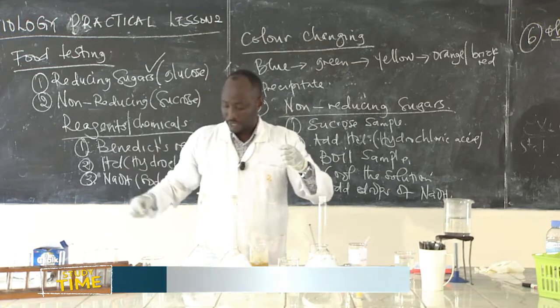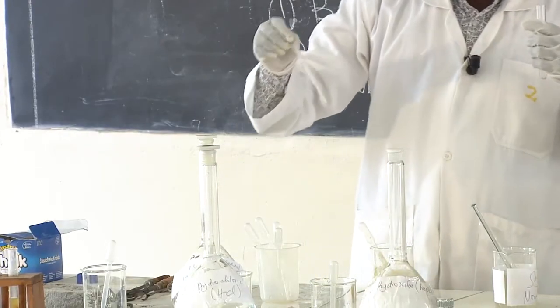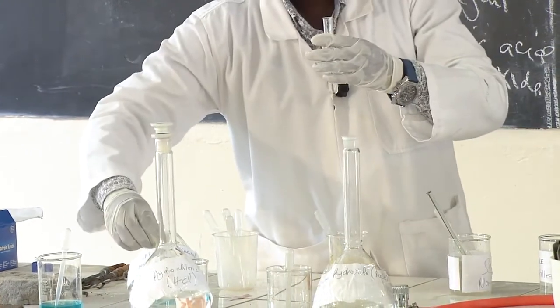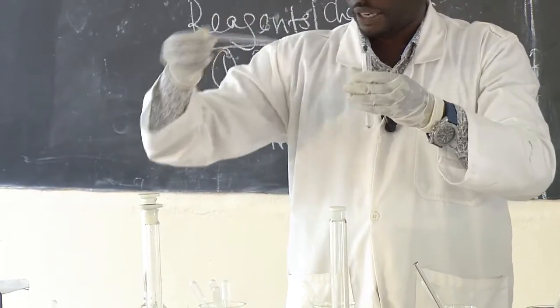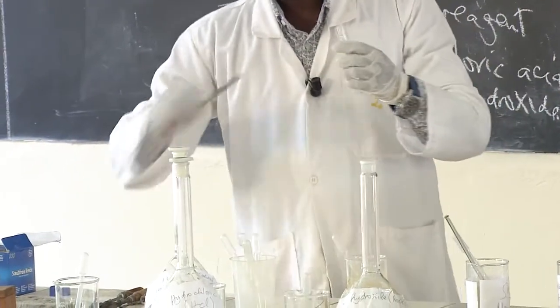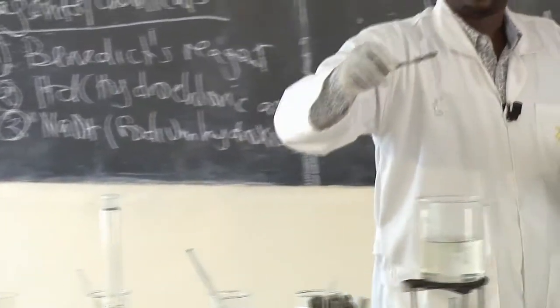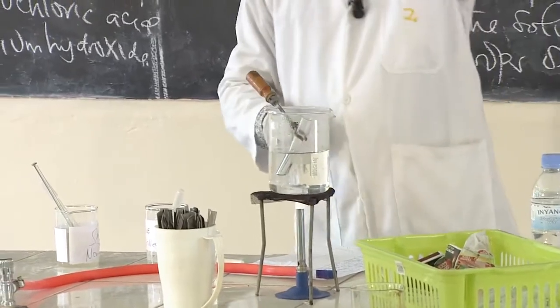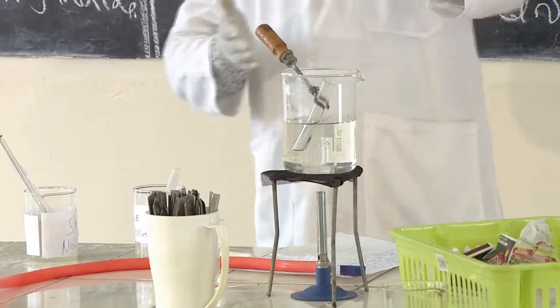I add some drops of hydrochloric acid. Then I put it into a water bath.